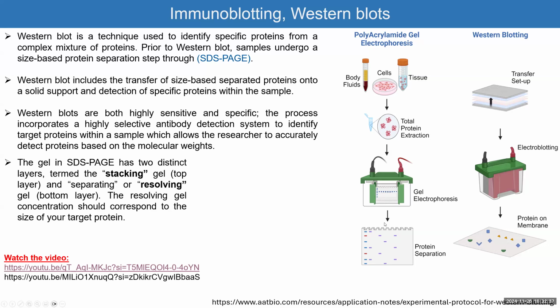And then you apply electric current the same way you apply it from up to down, but this time you apply it within the surfaces, from one surface to another. In this way, it's applied this way. If you do it for 1 hour, all the proteins within the gel migrate out and they find the membrane just in their face, so they're stuck to that membrane.